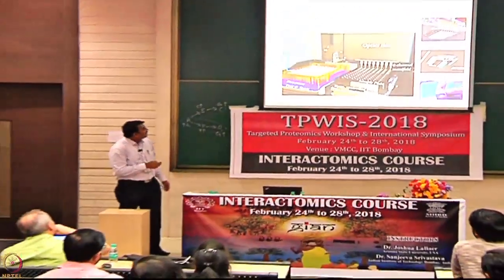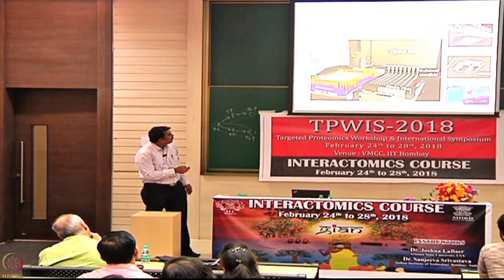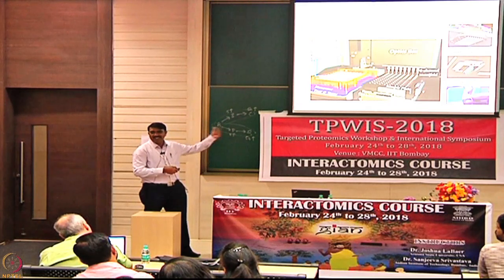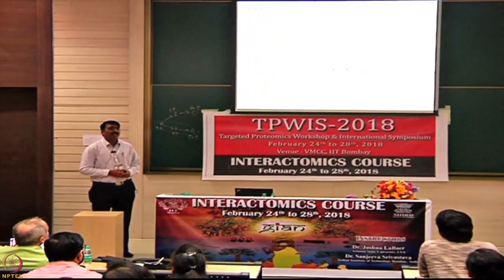Okay, so this is the sensor compartment. The robotic arm picks up the sensor and dips it into the well containing the first buffer. And I'll show you that in the subsequent slides. So what exactly is the principle behind this? As I mentioned, it's interference based.